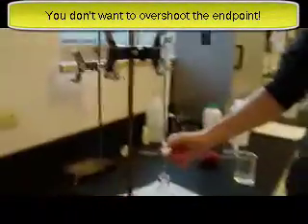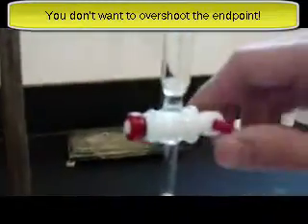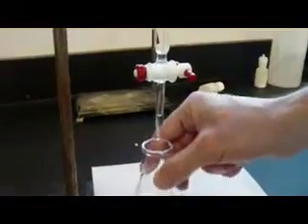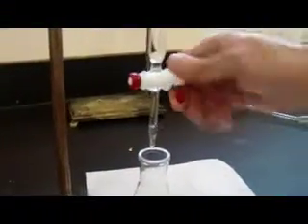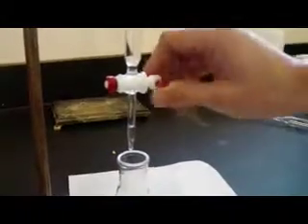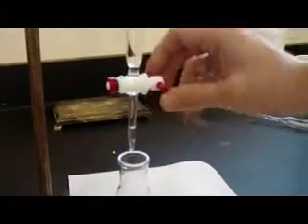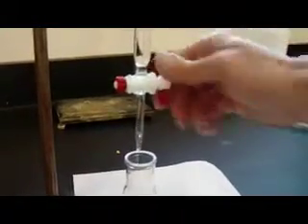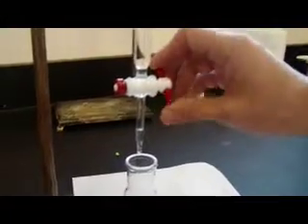Now, a really good way to do this is you just kind of twist. And if you just twist, you'll dispense roughly half a milliliter per twist and you're not going to overshoot, and it's good to swirl occasionally, and you're not going to introduce too much at a time, because every time it goes by, it just lets a little bit through. All right, now this is going to take a little while, so we're going to pause, we're going to come back, and you'll see as I approach the endpoint.